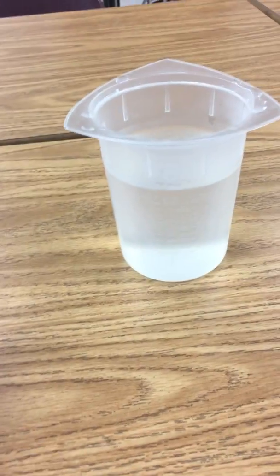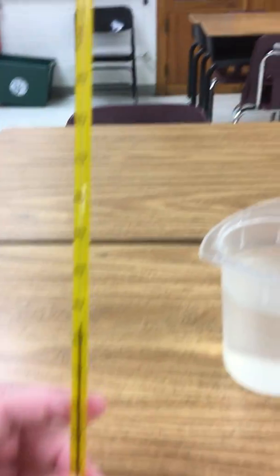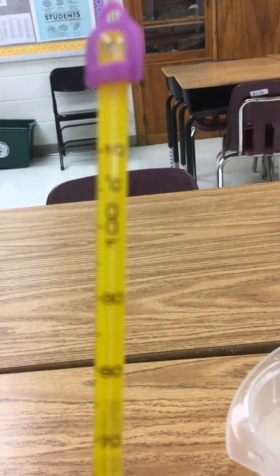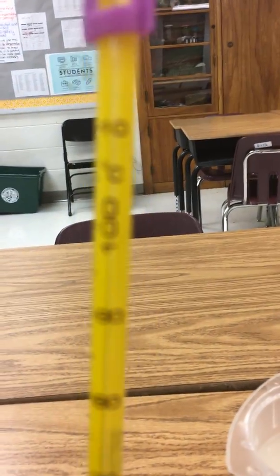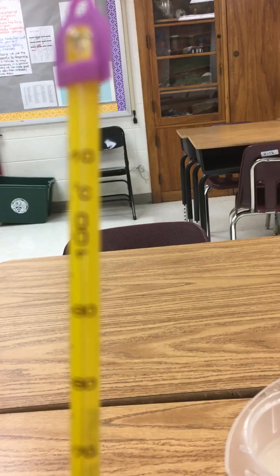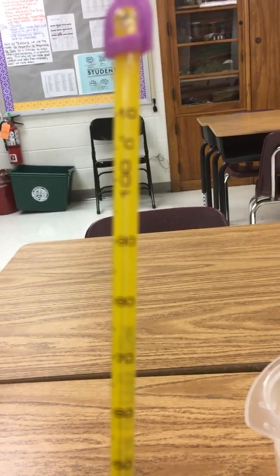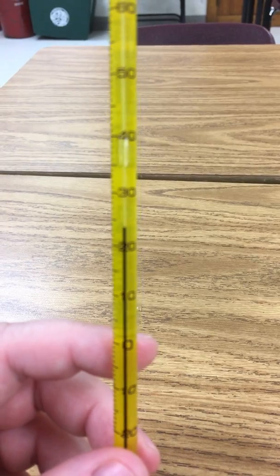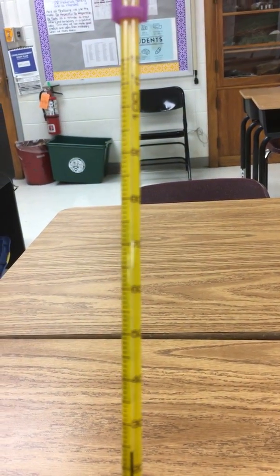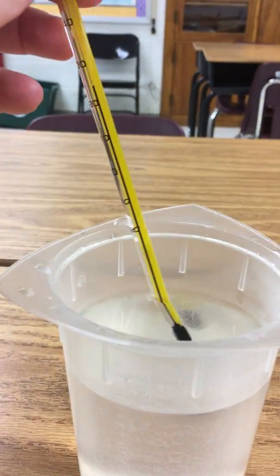So as you can see here, I've got an unknown liquid in my beaker and I'm looking at my thermometer. I noticed something immediately that's different from most thermometers, and that's that degree C symbol — that's for degrees Celsius. In science we use the metric system, so we won't be using Fahrenheit in class. Degrees Celsius is pretty cool because zero degrees is the freezing point of water and the boiling point is 100 — kind of easier than 32 and 212.